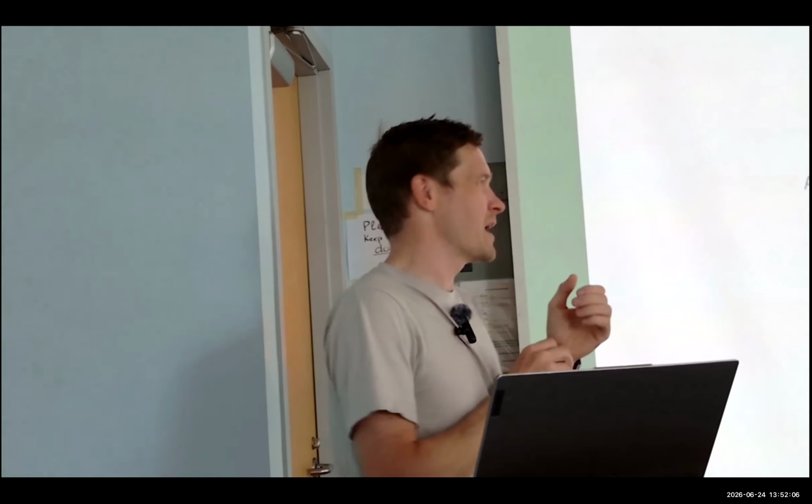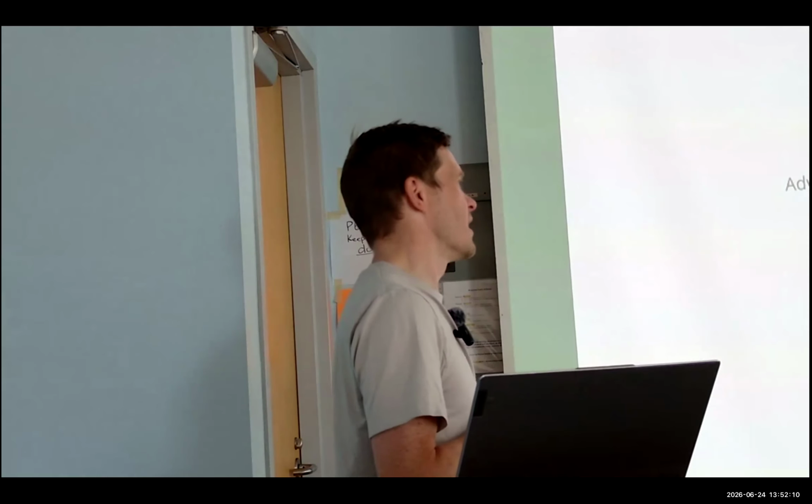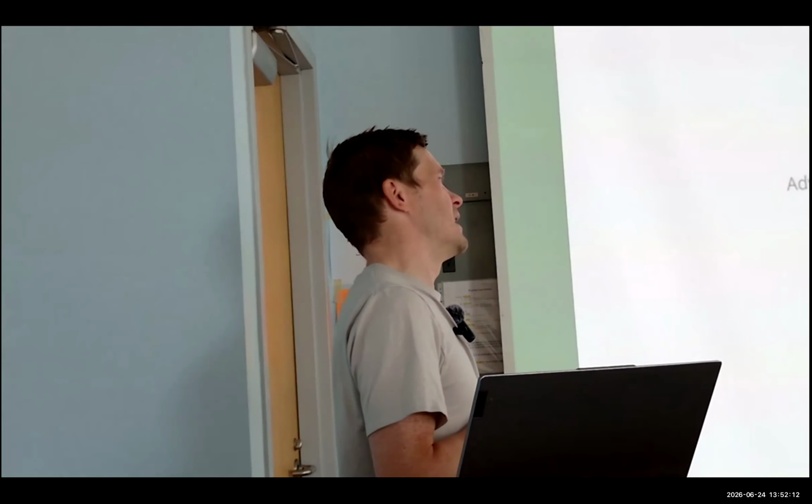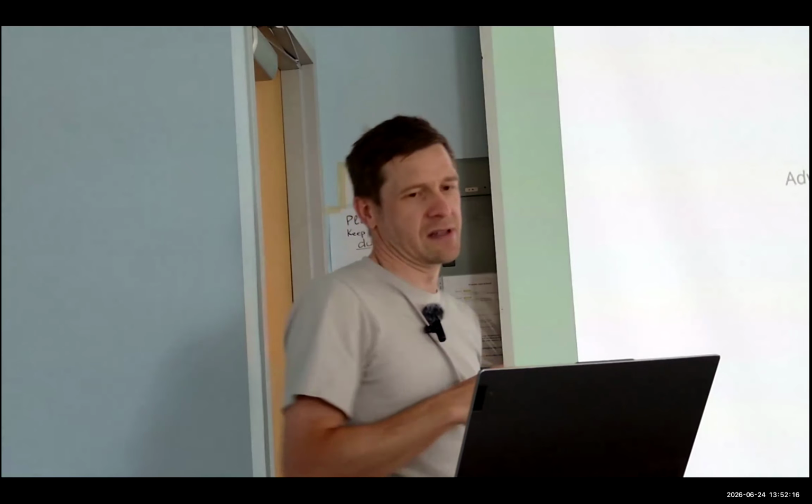The sweet spot is short exposure, 10 to 20x magnification. That's really where you get the biggest uplift in performance from line scan. So that's something to think about, because it's super fast and really cool, but it's not always the right answer.